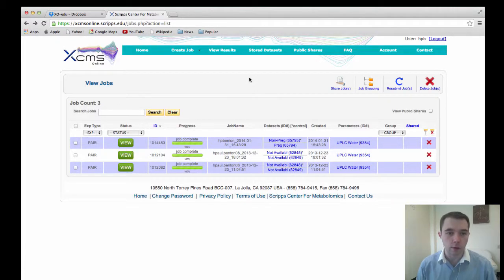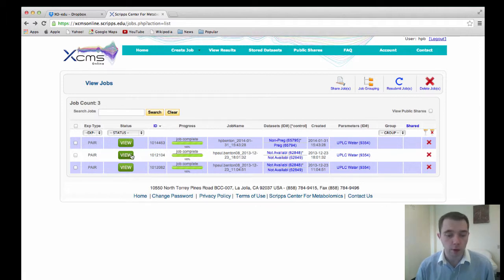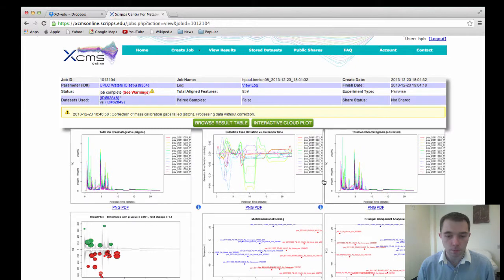Here you can see that we've already logged in to XCMS Online. We have three different jobs which have completed. If we hit on the view, we can see all of the results, which have already been explained in other videos.